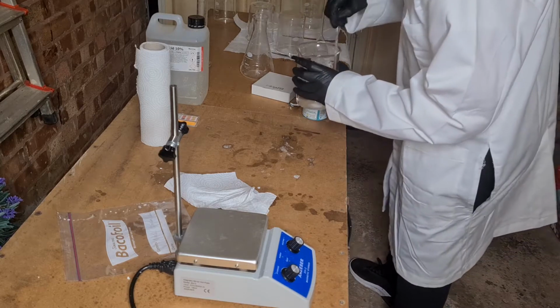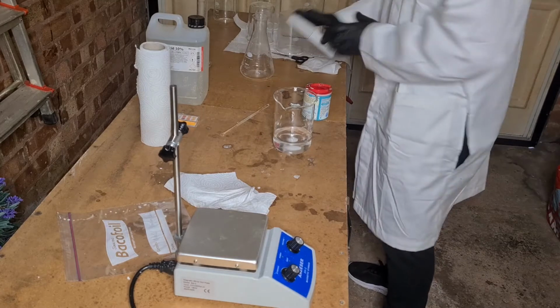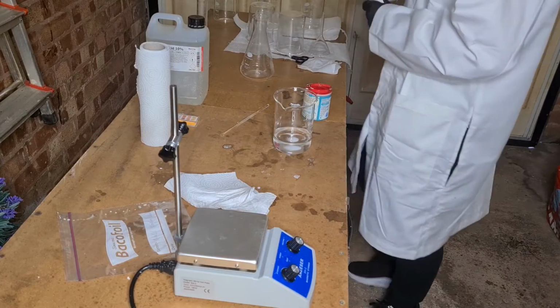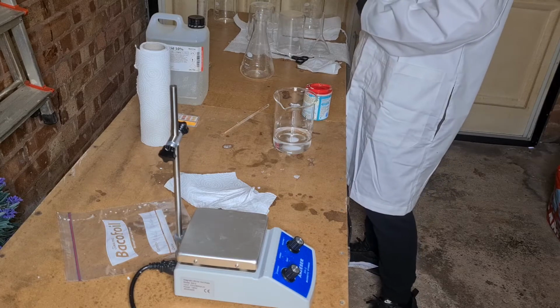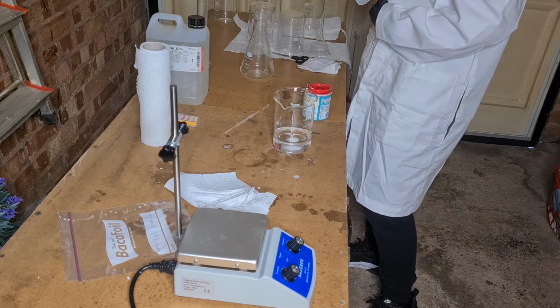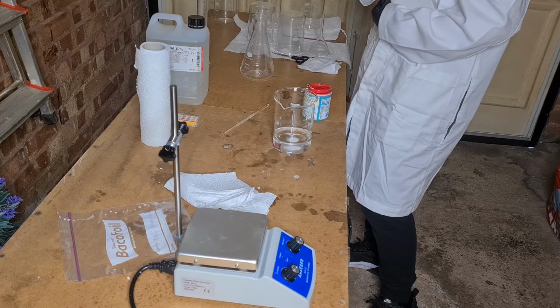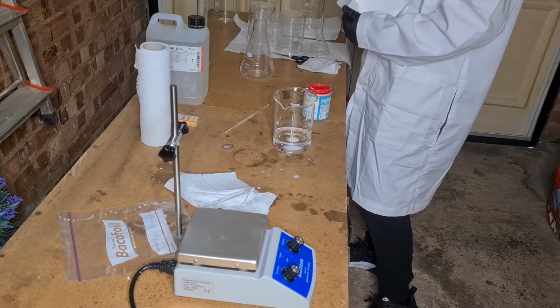So now this is in excess, so just grab some filter paper. I'm going to filter into this conical flask. It's quite hard to just get one of these out, especially when wearing gloves, but I will try, and almost got it. Yeah, I managed to somehow get one.